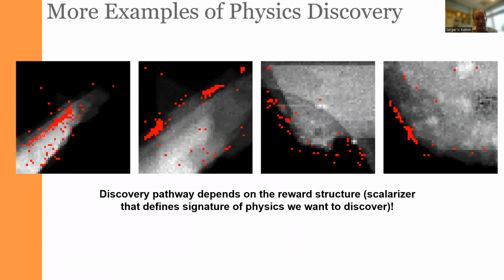So we can see that the microscope has consistently taken the measurements in some special locations. Here, it really likes this edge, but not this edge, and not this edge, and not these edges. Here, the microscope preferred to do the measurement at this location and this location, but somehow decided that this edge is not interesting. So why does it matter?